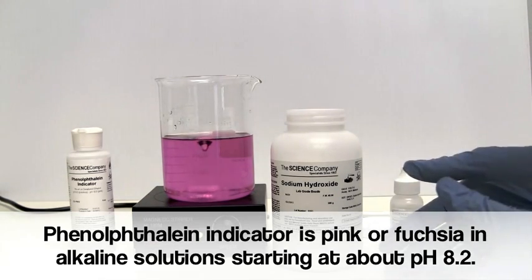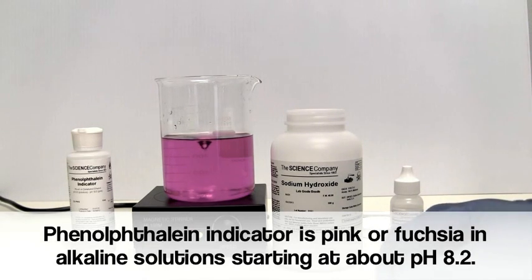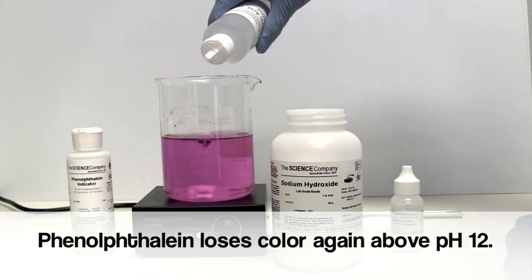Phenolphthalein will be colorless in neutral and acidic solutions. It begins to turn pink at about pH 8.2 and turns dark pink or fuchsia at pH 10. In strongly alkaline solutions above 12, phenolphthalein loses its color again.